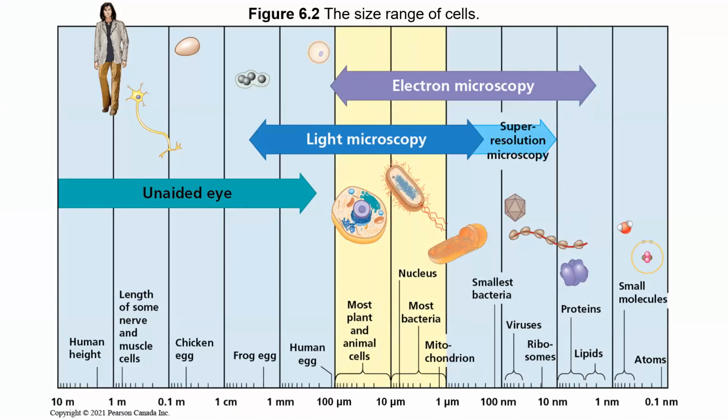A lot of these things are in the realm of cell biology. We're talking about most cells, animal, plant, or bacterial. We need some sort of microscope to see them. If you get down to smaller things like viruses, you can see here's a virus right there. In fact, we're going to need an electron microscope for that. One more thing that we will talk about, that's not mentioned in the textbook yet, is something called scanning probe microscopy, which is a pretty cool, newish technique. If we don't make it today, we'll get there on Monday for sure.